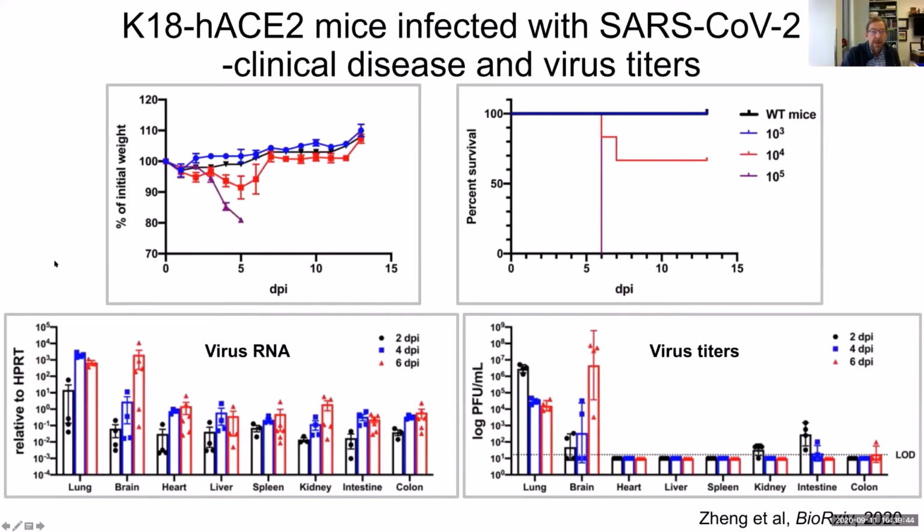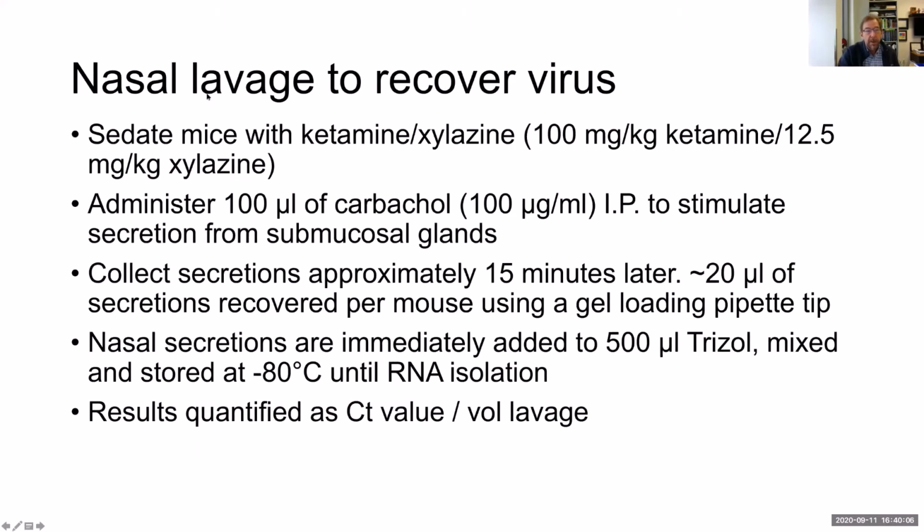Sure. So, this is just some data from our recent work with the K18 mice, showing on the bottom here looking for virus by qPCR for the genome and then titering across multiple tissues here. We've also been playing around with nasal lavage in mice to recover virus. What we initially tried was lavaging the nose with 20 microliters of saline, but the recovery was minimal.